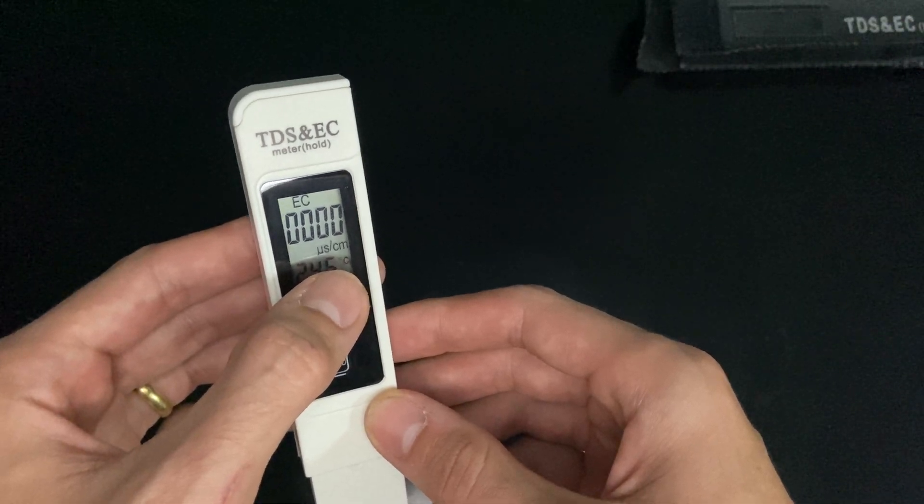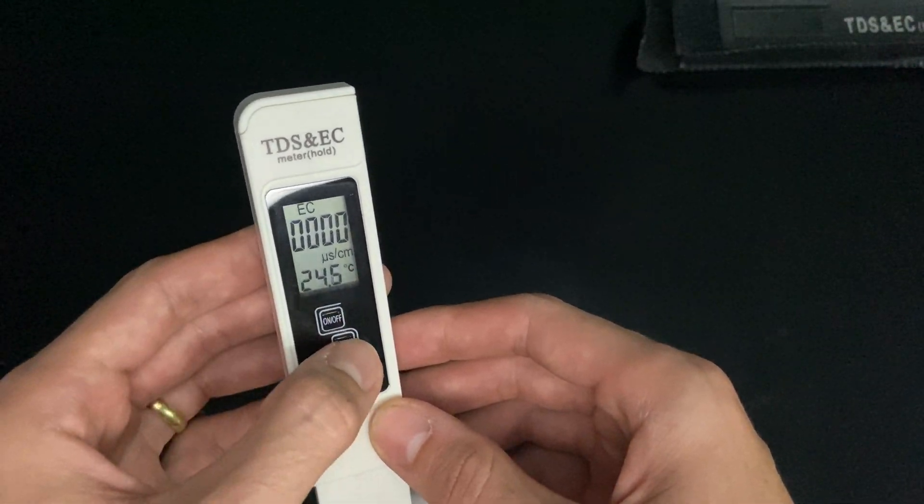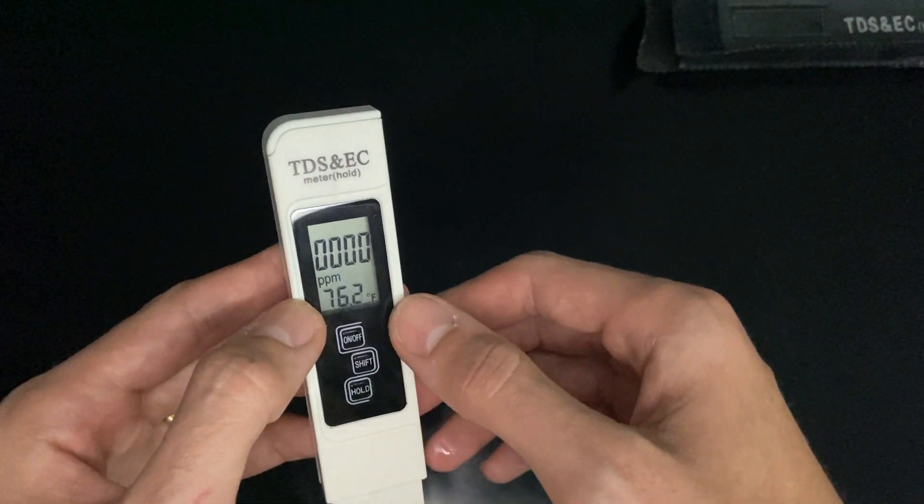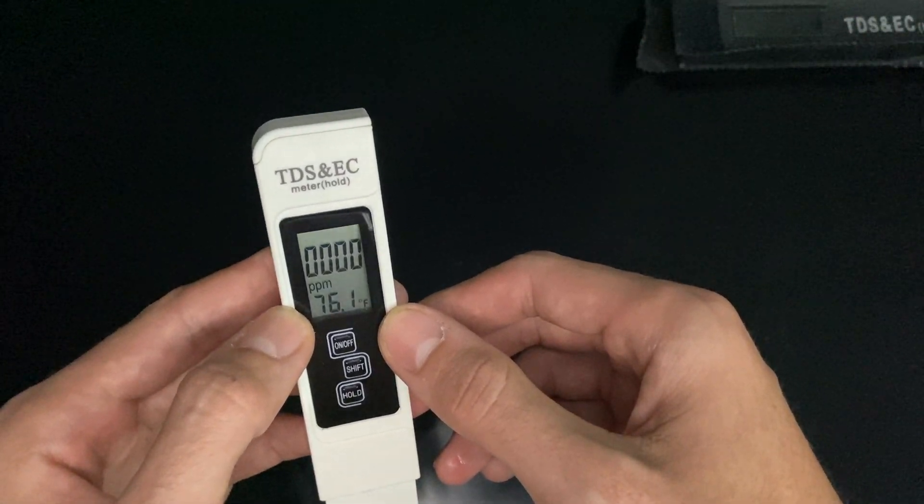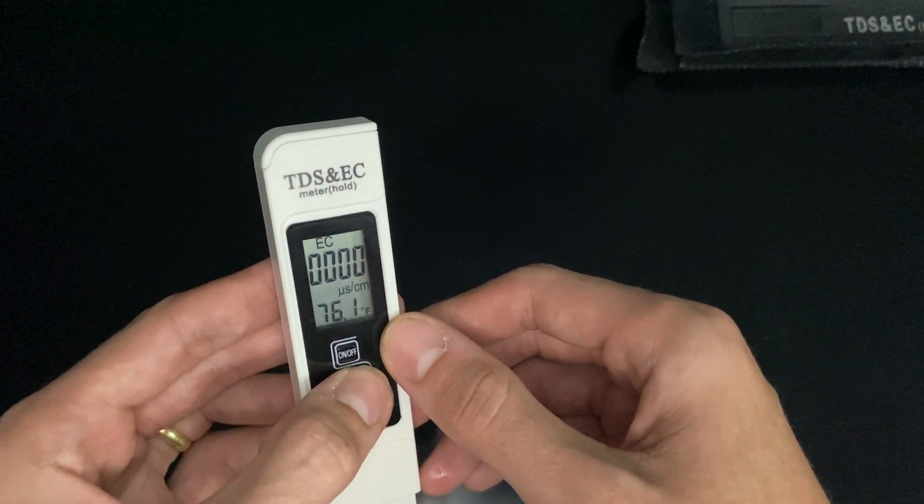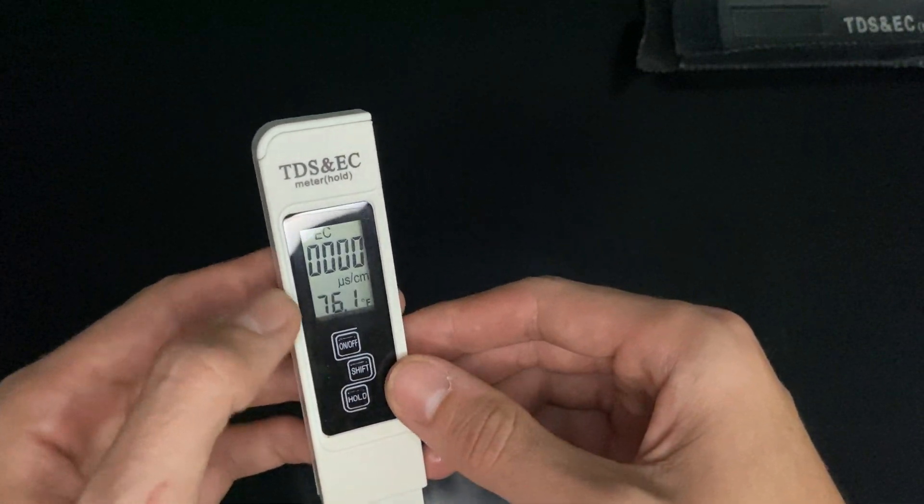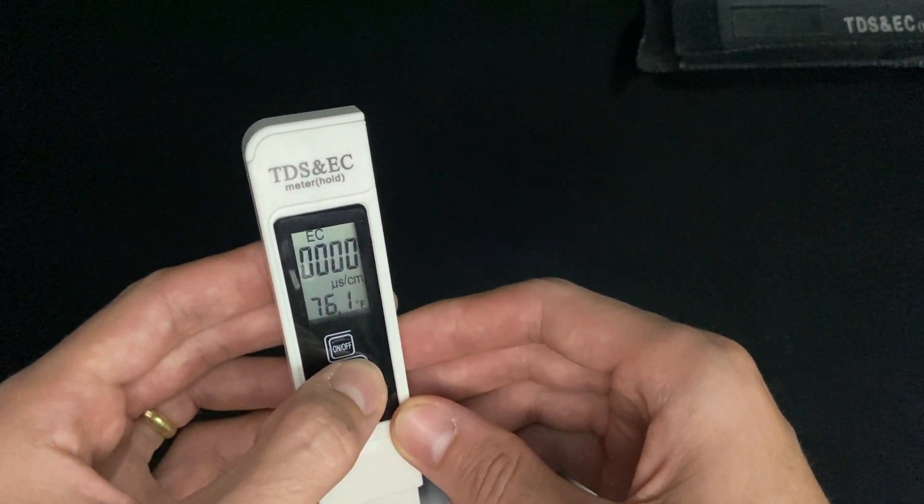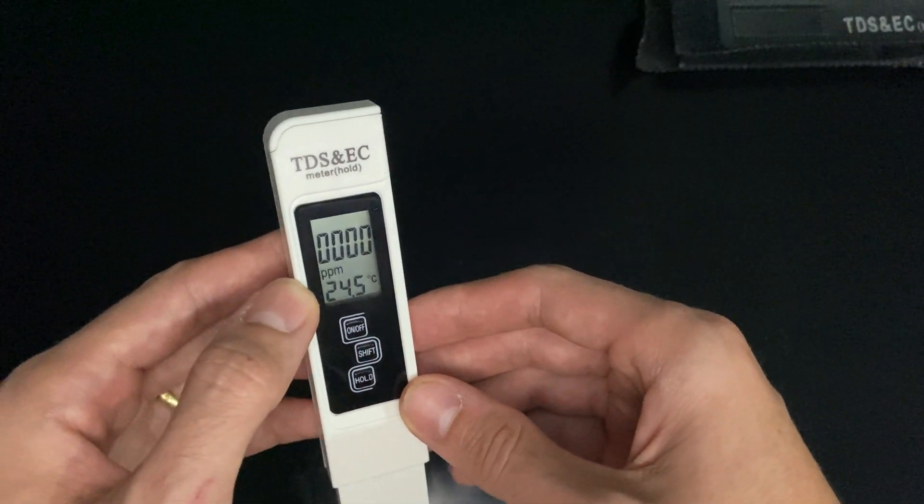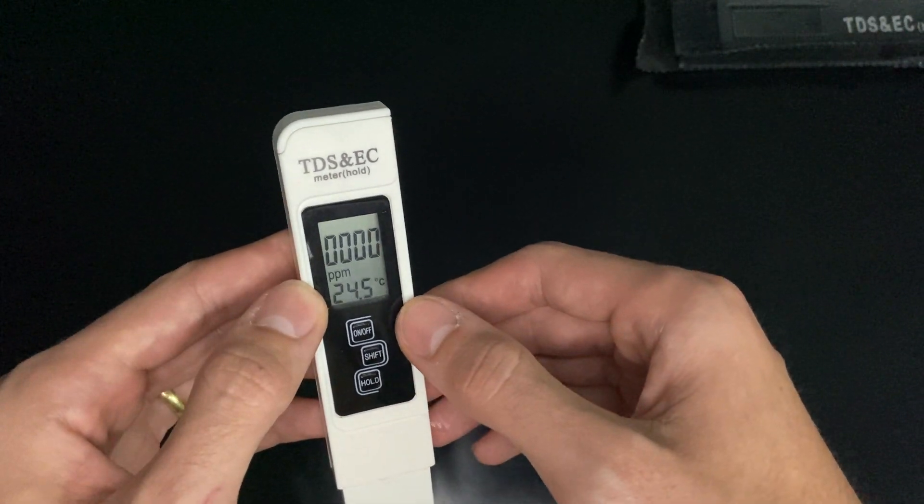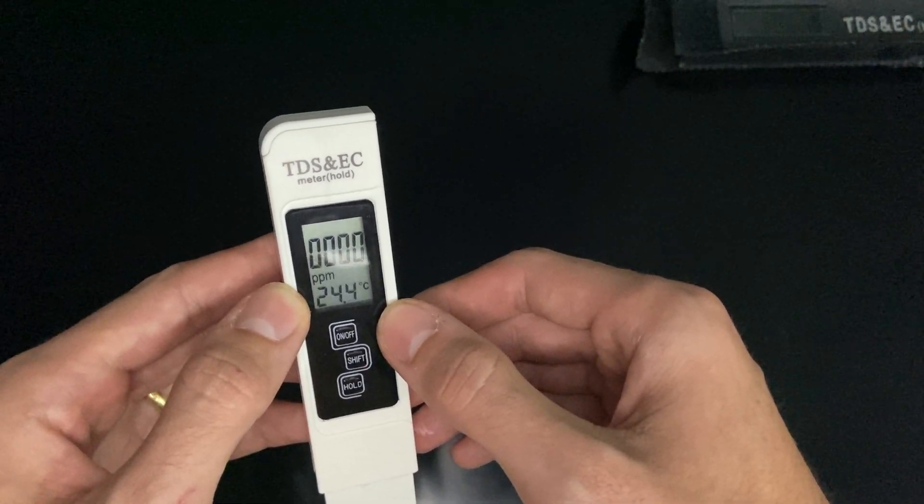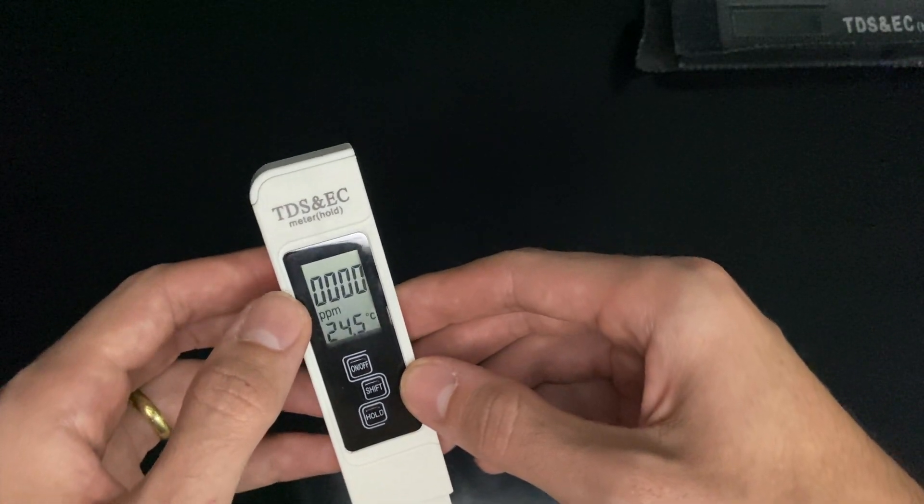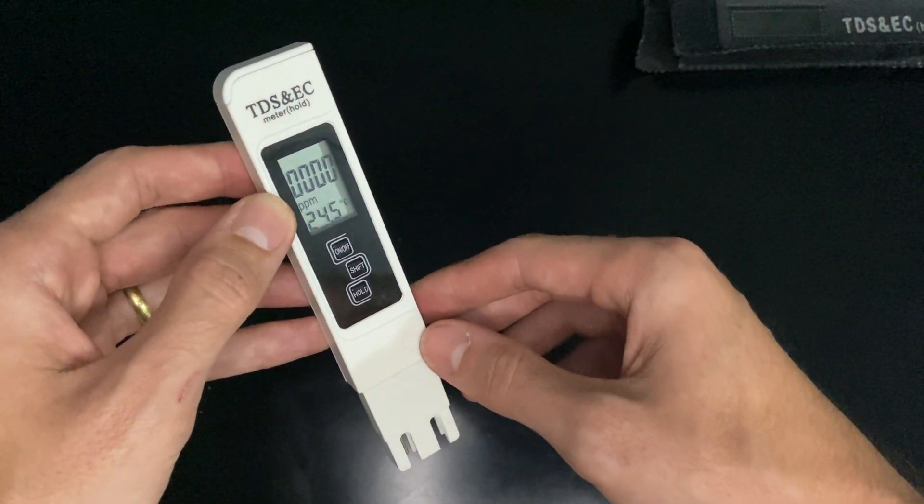If we press shift again, we can get the temperature in Fahrenheit and the electricity in the water. As I'm located in Brazil, I use degrees Celsius. How does it work? When you put this instrument inside the water, it shows you a value.